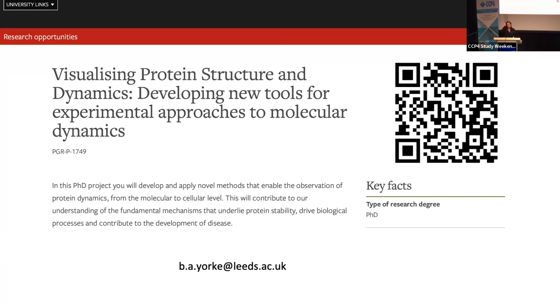I thought it was really interesting that your crystals seem to cluster either into fresh or aged. Is there any kind of mixture or intermediate states on the way? Yes, there are indeed. We've been doing some time-resolved experiments on faster processes, but it's quite difficult to know exactly when the crystals are going to be in that intermediate state between fresh and aged, because it takes quite a long time.